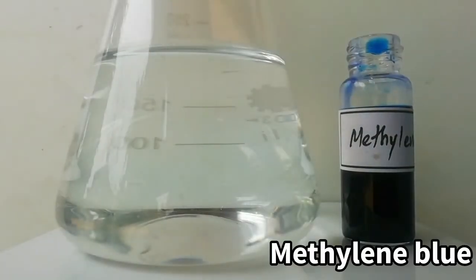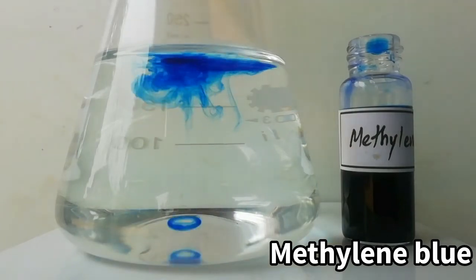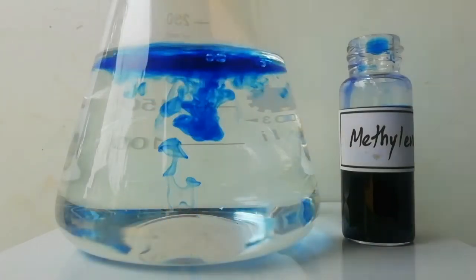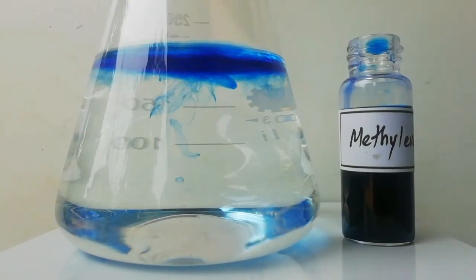Now add 1 milliliter of methylene blue solution. When it mixes with the basic glucose solution, the blue color will disappear.